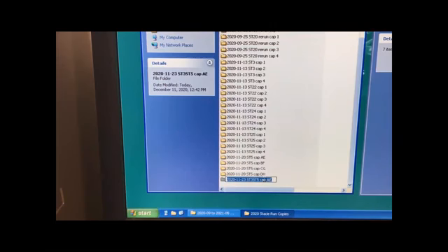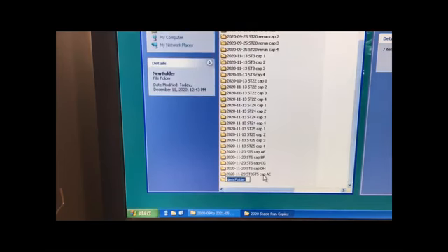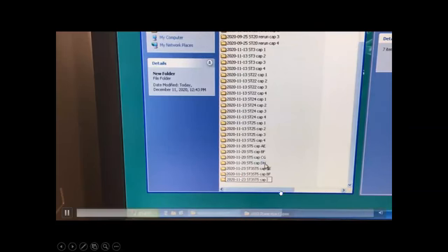What does that mean? Well, it's the first capillary of the 4. The first time it injects, that first capillary goes into sample A, into row A. Then the next time it injects, it goes into E. So the first time those 4 capillaries go into tubes, it goes into row A, B, C, and D. And then the second time the capillary goes into the tray, it goes into tubes E, F, G, and H. All right, remember, your tray has rows, 8 of them: A, B, C, D, E, F, G, H. Okay.